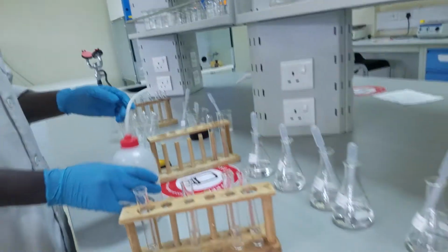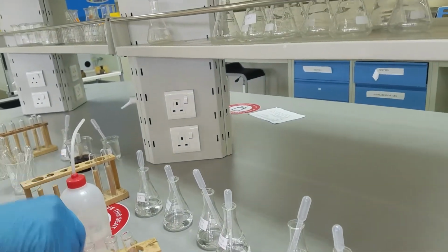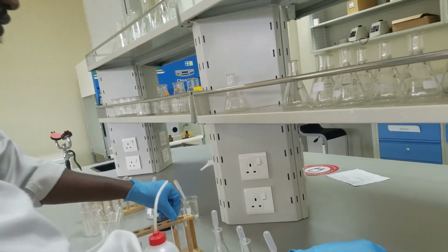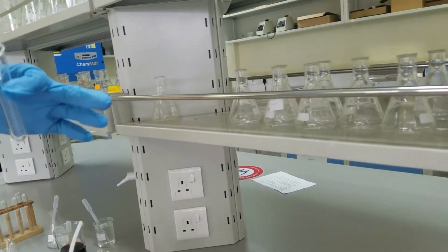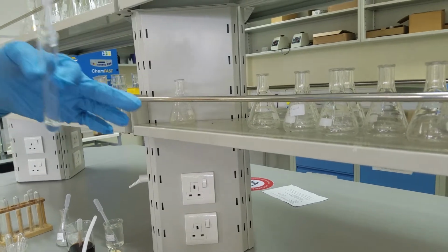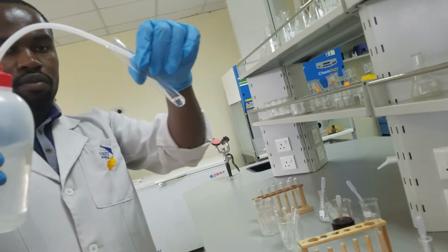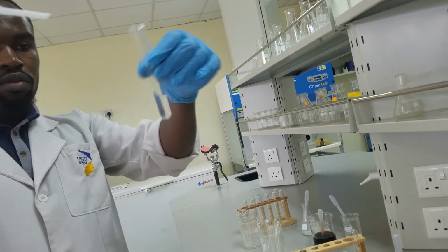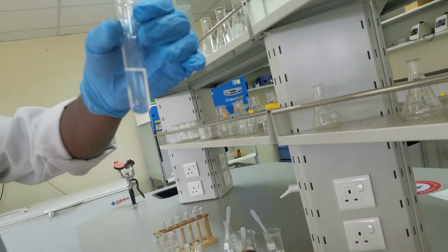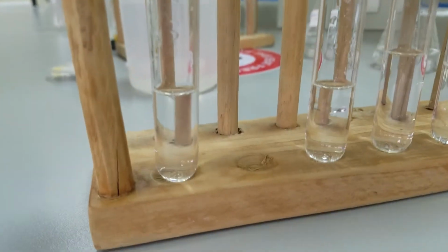Now we are going to do our unknowns and see if you can identify them from the 4. Our first unknown is unknown B. Add a few drops. Then you add distilled water. See if there is any observable changes.